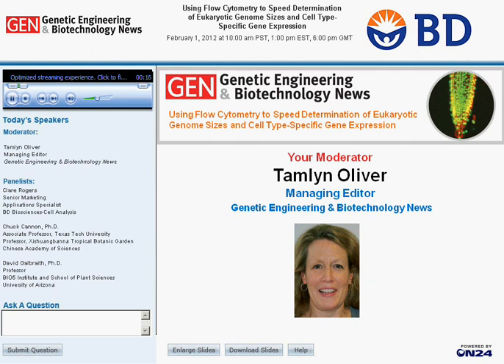Flow cytometry provides a convenient and accessible method for analysis of plant genome sizes and for other comparative studies. Application of this technique to plants has been limited, however, due in part to the need for sample preparation that yields particle suspensions without cell perturbation, the limited dynamic range of conventional flow cytometers, and the affordability and complexity of most flow cytometry platforms. The three speakers today, David Galbraith, Chuck Cannon, and Claire Rogers, will address these concerns and share their solutions in a minute.